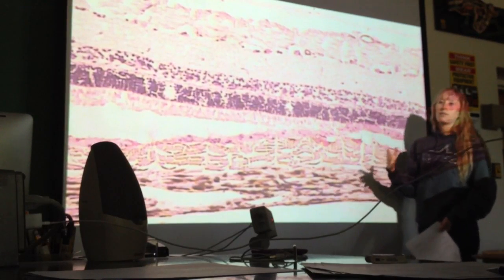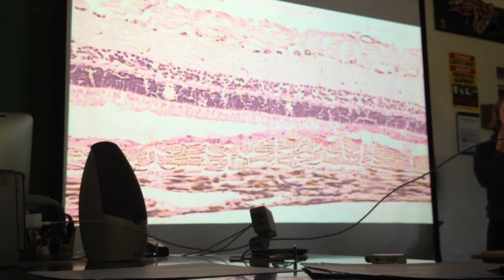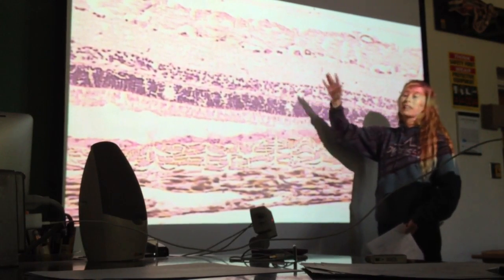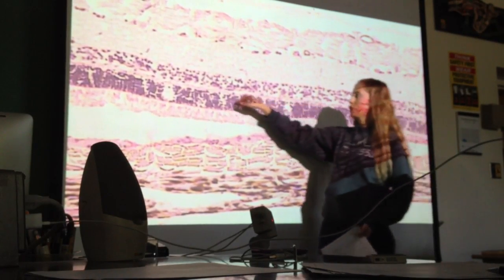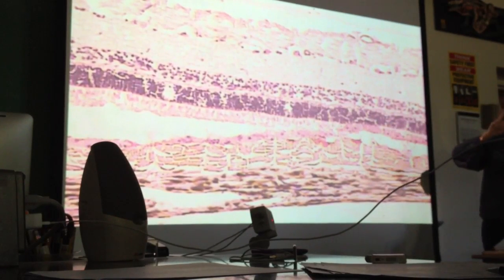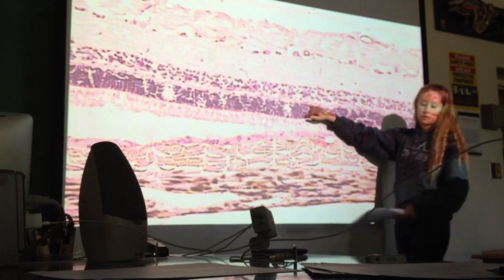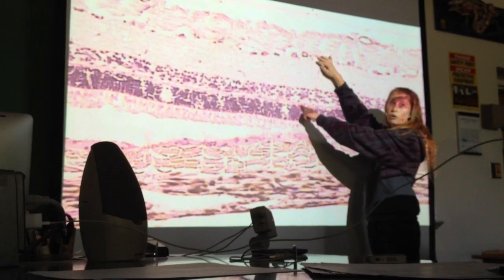Now the next layer we have are bipolar neurons, and bipolar, bi means two, right? So what that means is that there's axons coming out on either side, kind of like relaying information from this side to that side. So you see there's a light patch here and a light patch here. Those both belong to the bipolar neurons layer. So bipolar, two light patches, on either side of the neurons. So everywhere from here to here, that's all bipolar neuron.